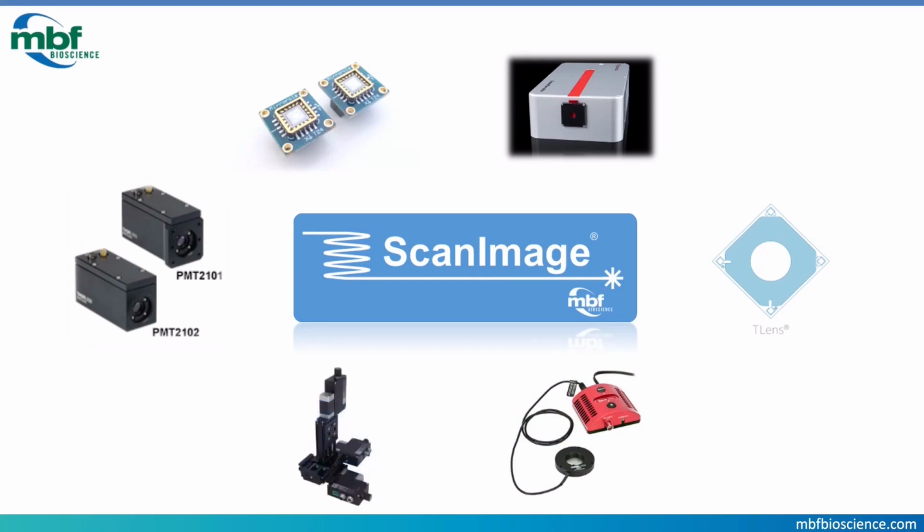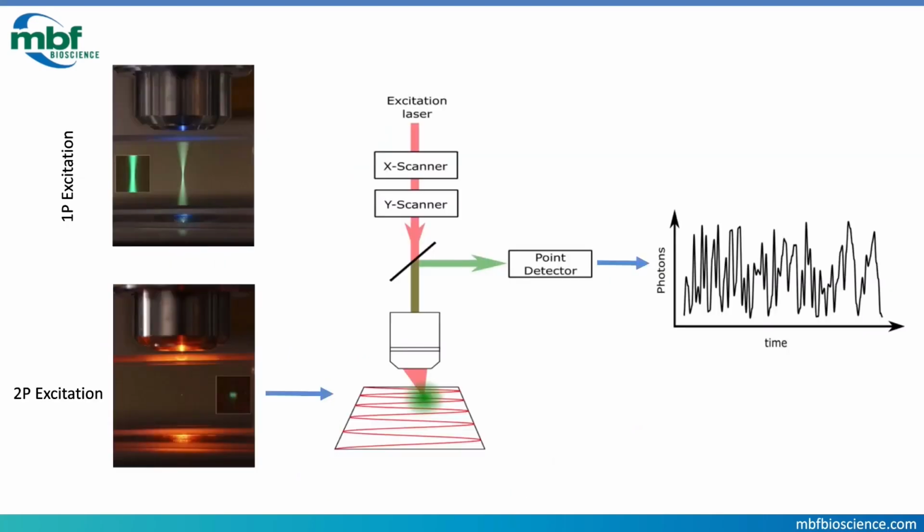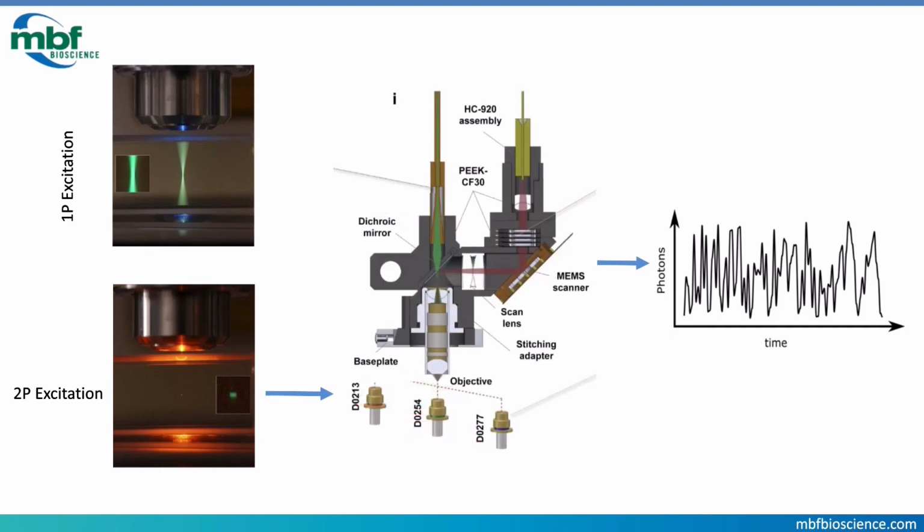We also support a variety of motorized stages like the Thorlabs Kinesis stages, Sutter MP285, some PI stages, and in particular, we like Zaber stages for their software implementation, which provides a very stable interface. Using these devices, ScanImage then can, of course, coordinate planar and stack acquisitions and organize the PMT data to form images.